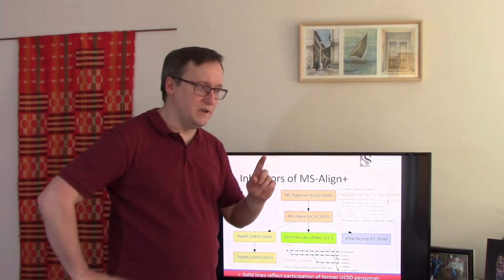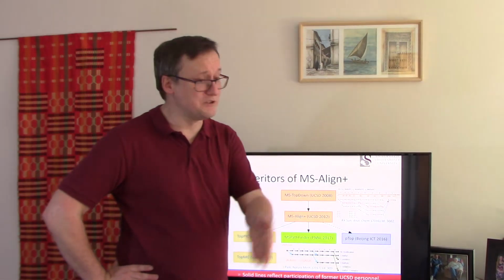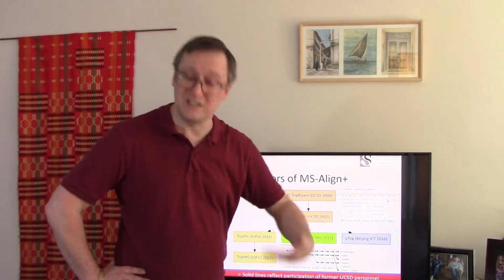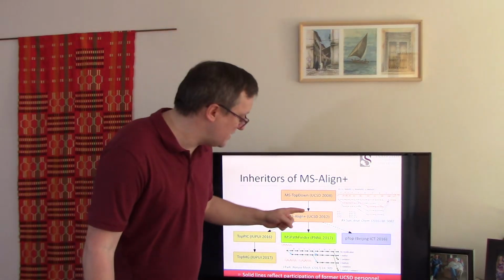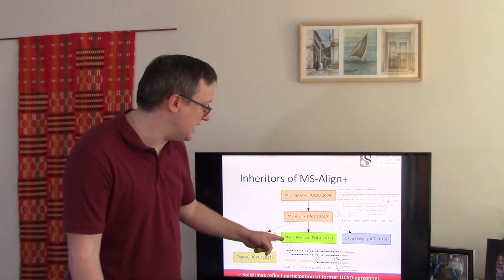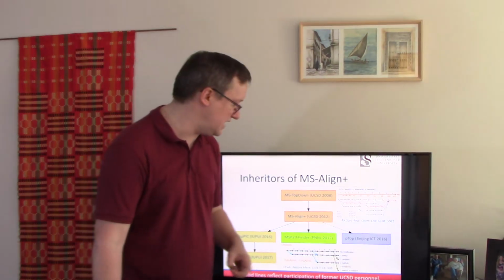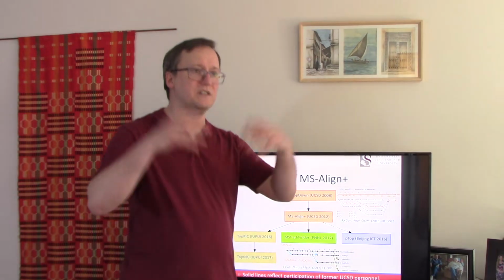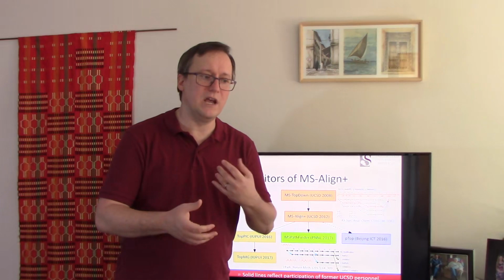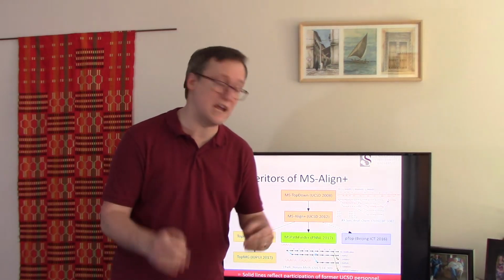Now, I note that the folks who graduate from the Center for Computational Mass Spec frequently went on to work in some very high-powered labs, and they took the best ideas with them to go on and continue expanding them into the future. So we see that folks from CCMS went on to work at Pacific Northwest National Laboratory, where they created the MSPathFinder. You can see the paper for it was released in 2017. They found a way to treat the different nodes of the dynamic programming graph as chemical compositions, which they found to be very useful in limiting the search space down.